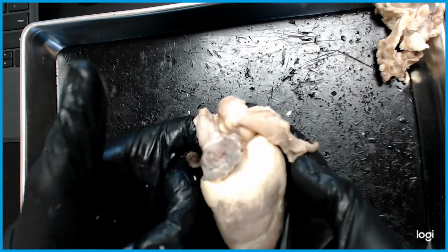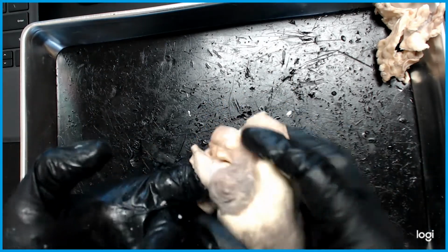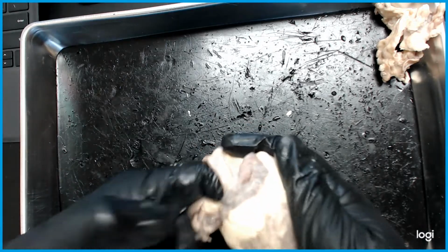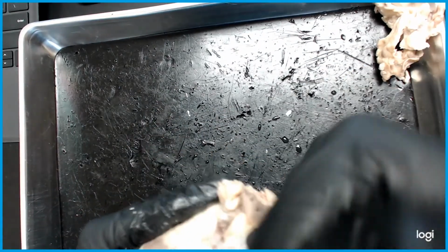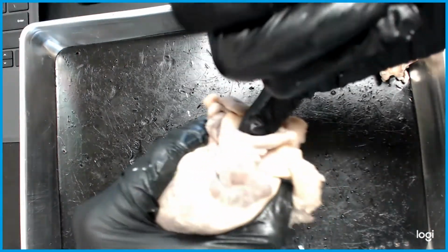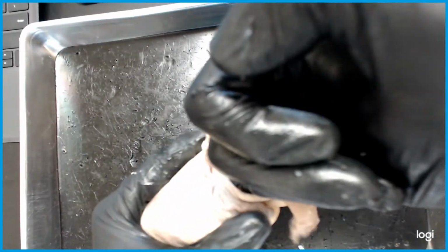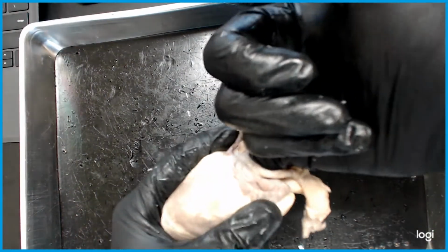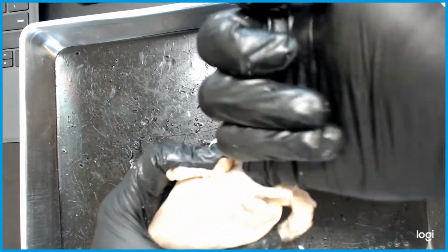This is the right atrium, this whole little section. That's the right atrium. You can put your finger in there. So when you do yours, go ahead and put your finger in there. Feel the right atrium. And you can follow through where it goes down into the right ventricle. And you can tell the space is going to be pretty small.